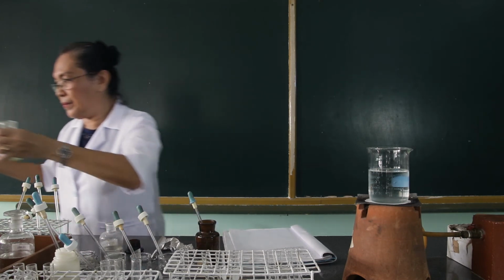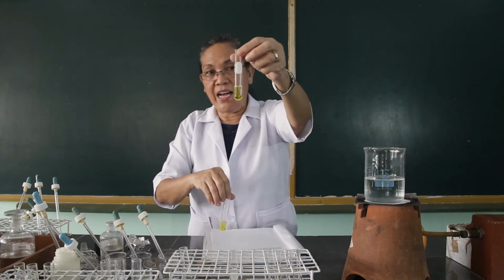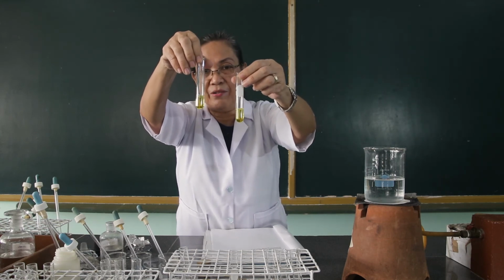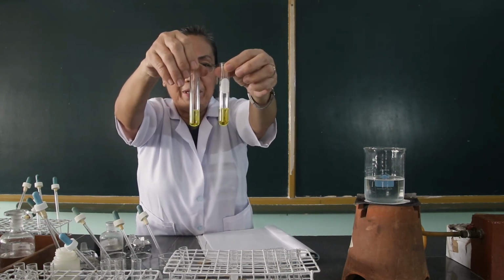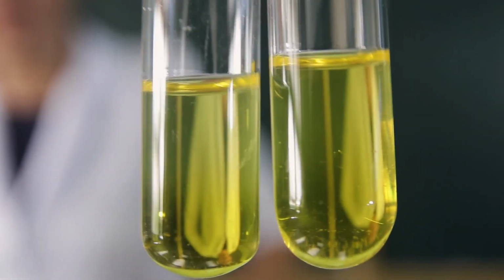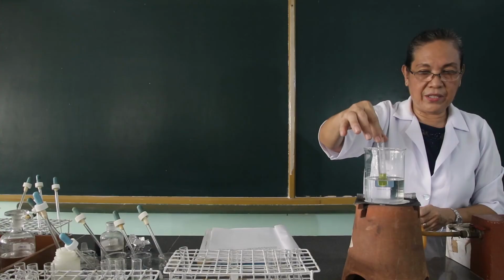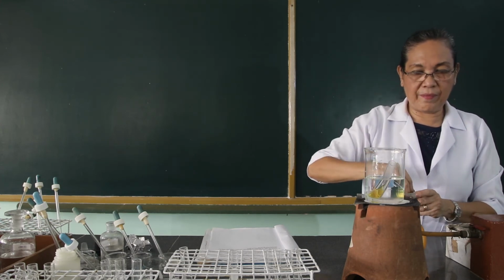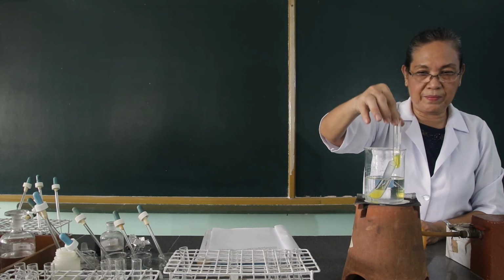This is the calcium and this is the strontium added with alcohol. Observe what happens.